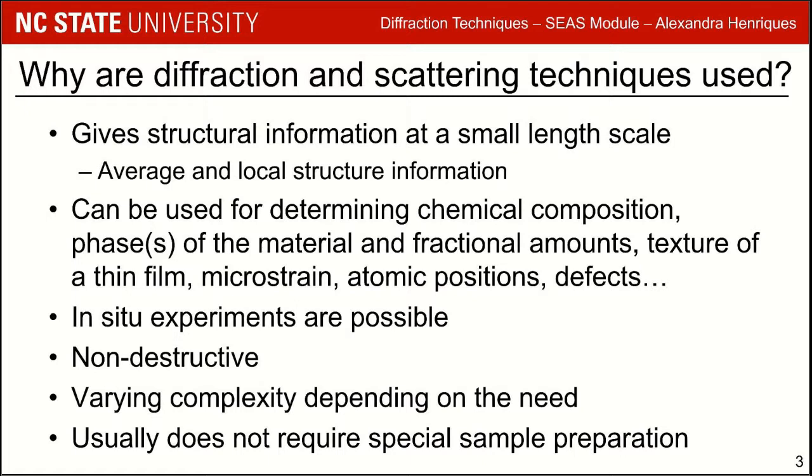Also, in situ experiments are possible with many diffraction techniques. These techniques generally are considered non-destructive in that they do not damage the sample in the process of collecting this data. They have varying complexity depending on the need of the experimenter, and it usually does not require special sample preparation. So if you have a powder sample, you can use that. If you have a bulk sample, you can use that as well. It can be used for thin films and a variety of material conformations.